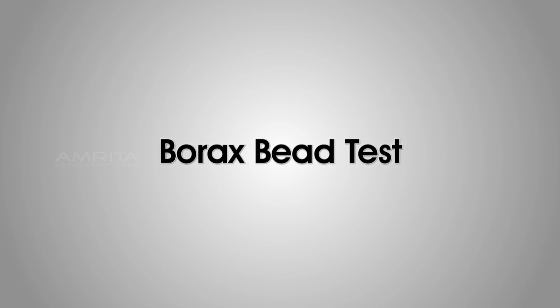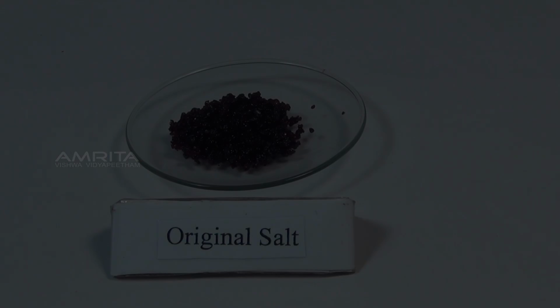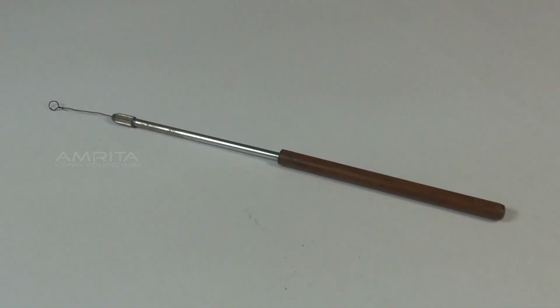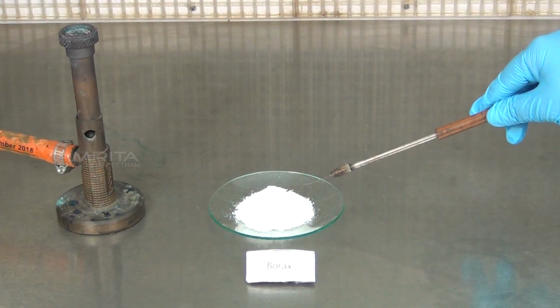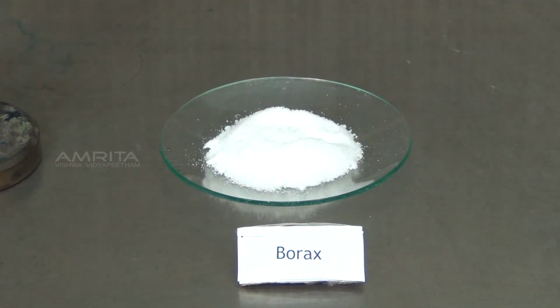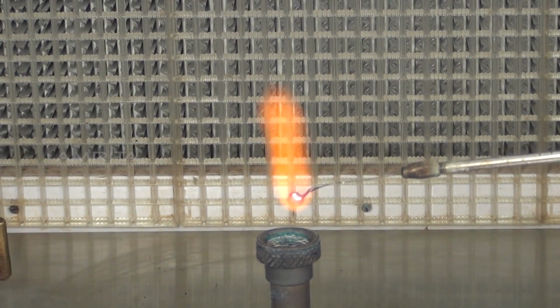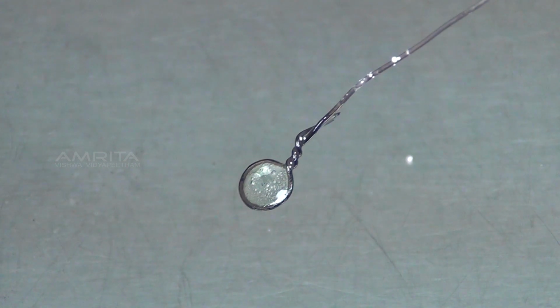Borax bead test. Materials required: original salt, borax, platinum wire loop and Bunsen burner. Procedure: take a small quantity of borax powder in the loop of platinum wire by dipping it in borax powder. Heat it in the flame of the Bunsen burner. Borax swells and forms a transparent colorless glassy bead.